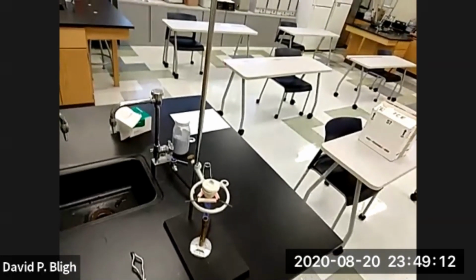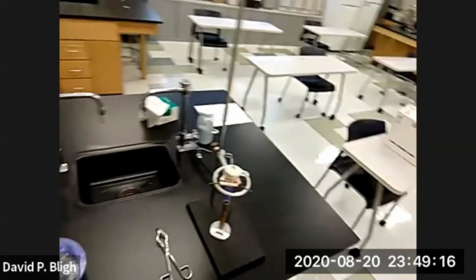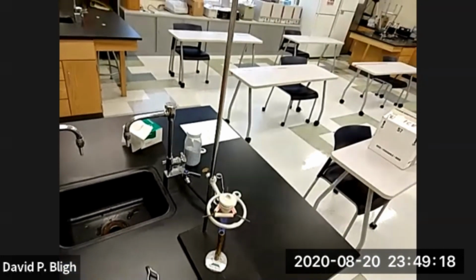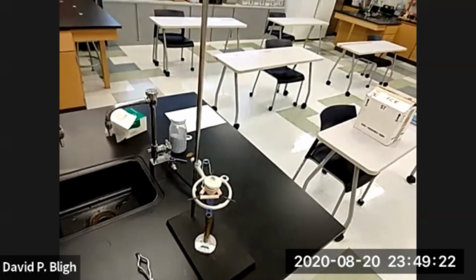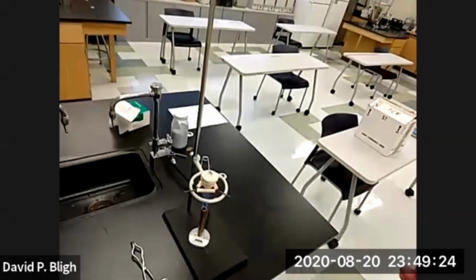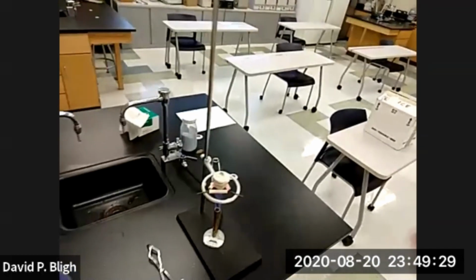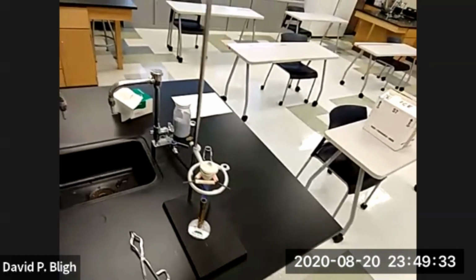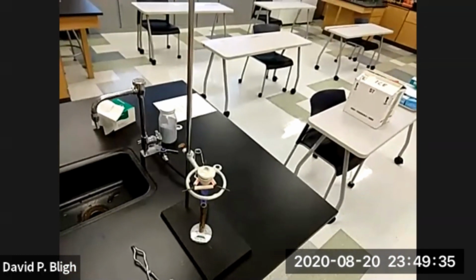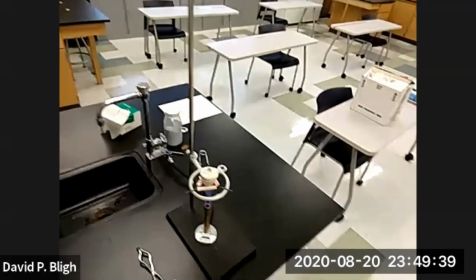In other words, the amount of temperature rise it needs to evaporate all the water is just a little bit, and then there's a big gap between that temperature and the next critical temperature, the decomposition of our copper sulfate. So we have a wide range, and it's good for student labs to have that range so that you can heat it with some variability and still get good results.